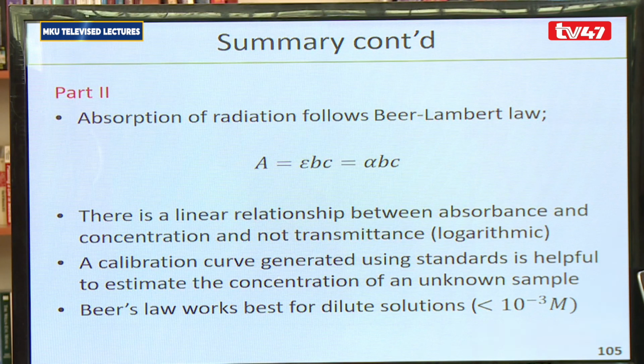If this does not happen, as an analyst, it's your opportunity to think about diluting the sample to bring it to the absorbance level that you want it to be at. You can always know by how much you will dilute the sample, because of course you can see the absorbance that you have measured and you can see the absorbance range of your calibration curve.